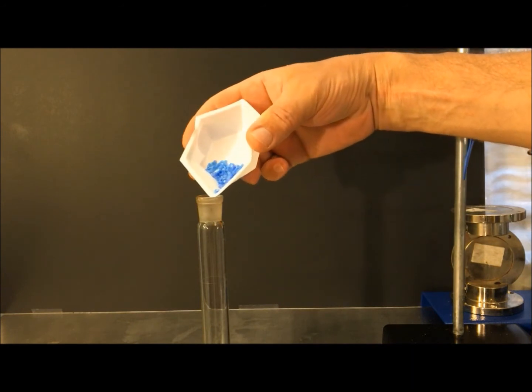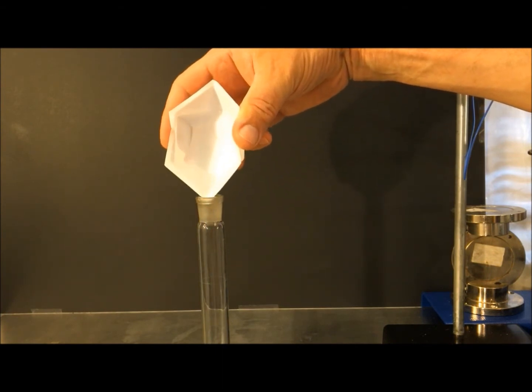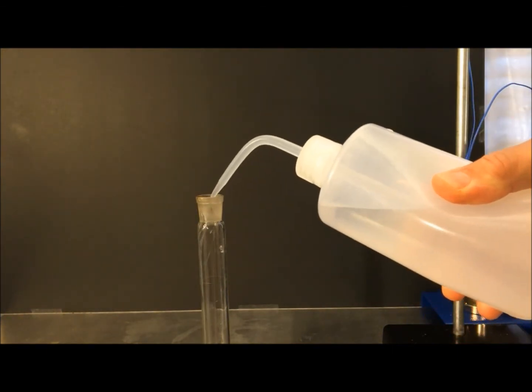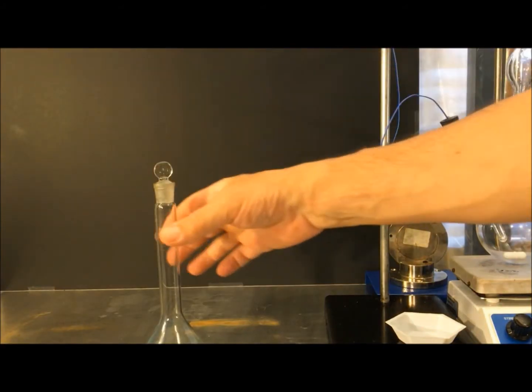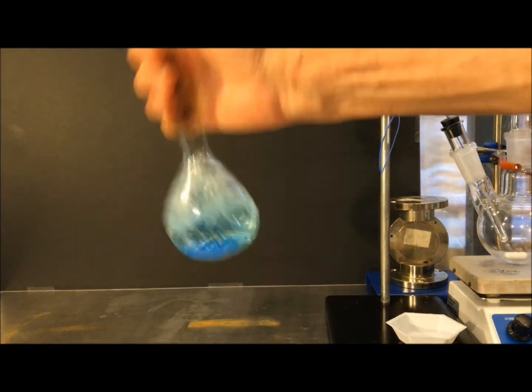And we'll add that to a volumetric flask with some distilled water in it. And then shake till dissolved. Now here's an important safety tip, kids.